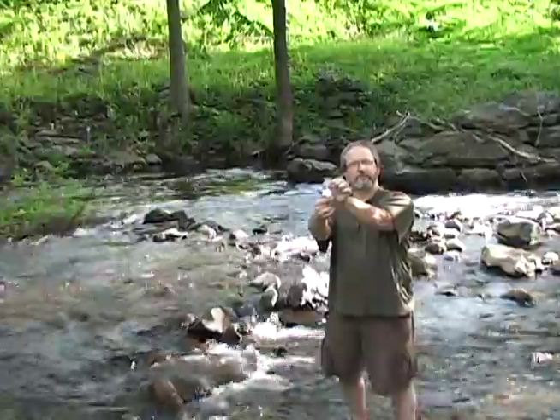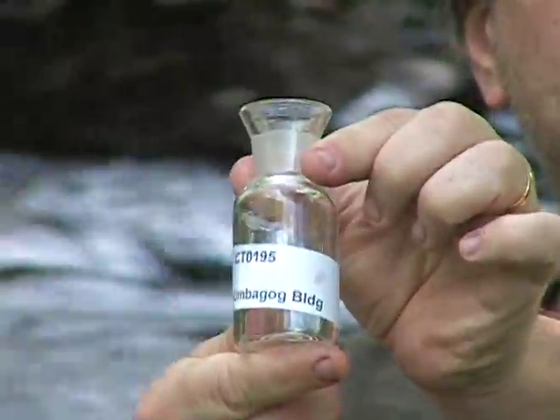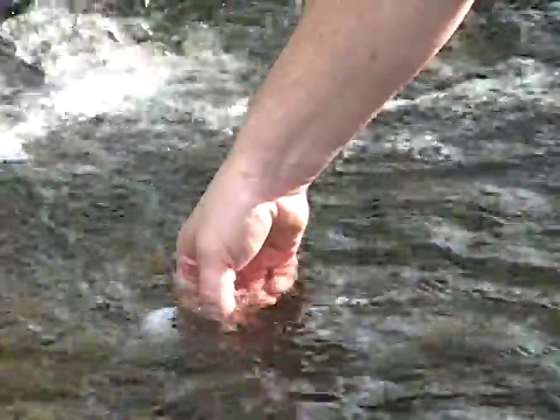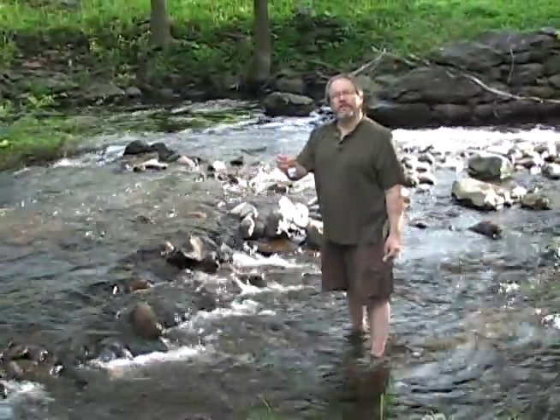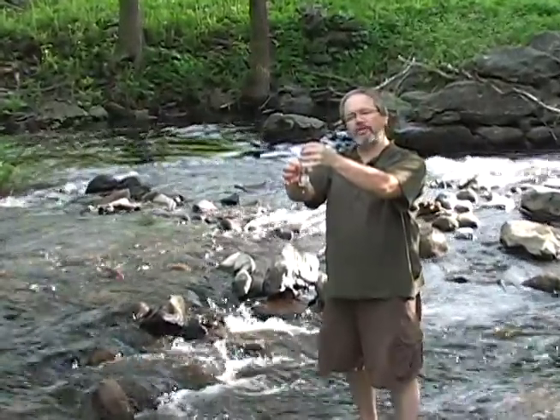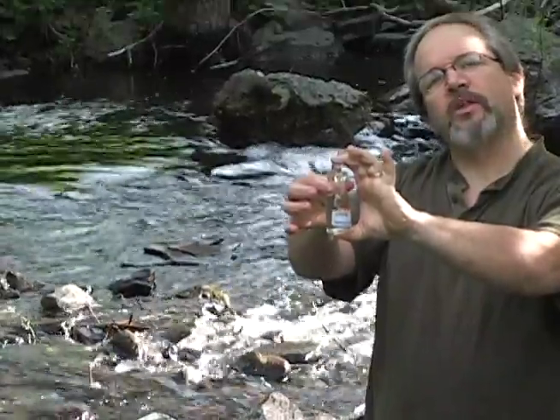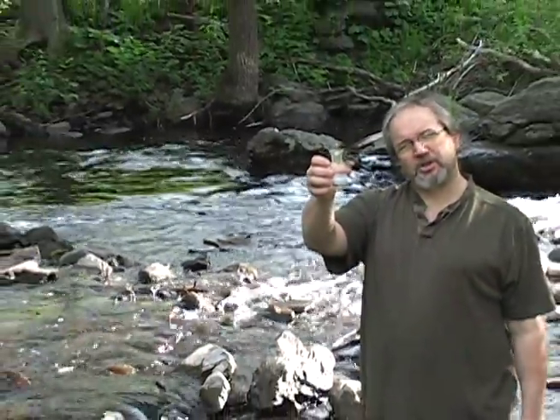Hold that up for a minute. Once you've got that bottle full, what you're going to do is take your stopper. You hold it about a quarter of an inch above, seated in place, and just drop it in. That will displace the extra water that's in there. Just dump off the excess and that bottle's ready to go for some additional testing. We'll add some reagents here on site before we head back to the lab.